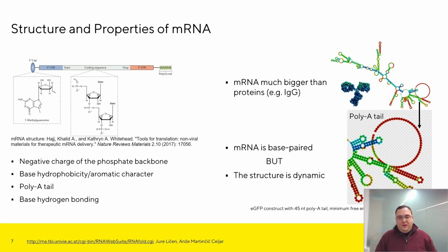While if we move forward towards RNA, it's also a very interesting molecule of nucleic acids, and they're usually quite big. So here on the right, I've highlighted it next to an IgG, and even a very short RNA like EGFP is twice as big as compared to the IgG protein itself. So with such an increase in size, new chromatographic techniques are, of course, recommended.